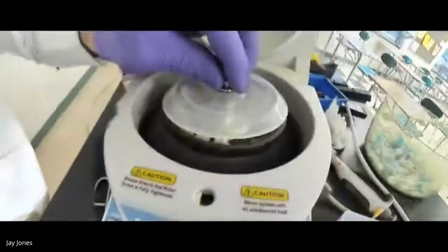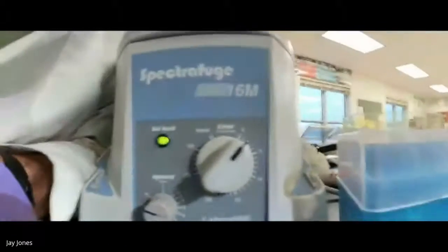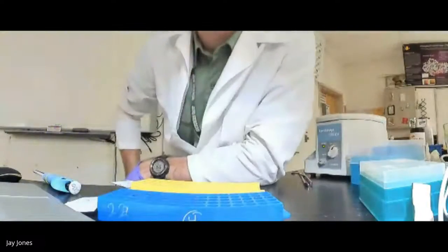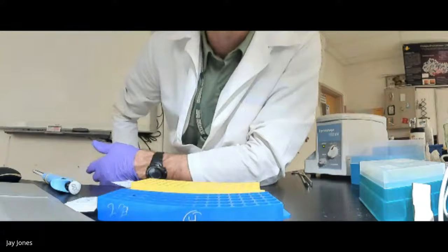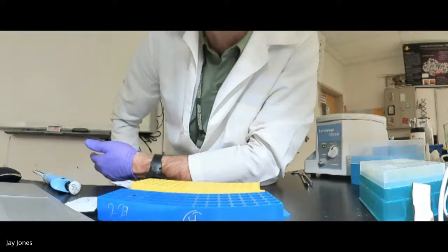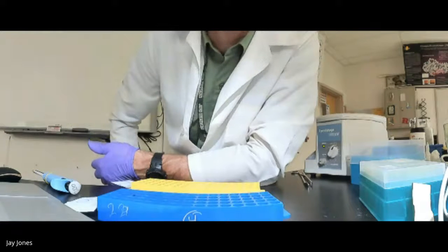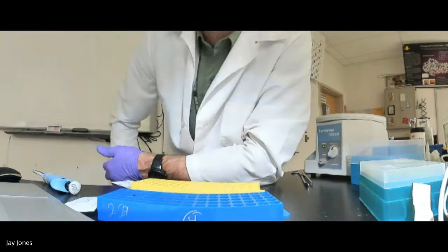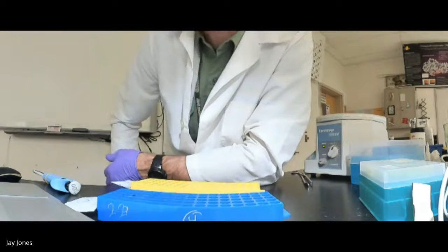Okay, let's do it. We're gonna flow the elution buffer, which is mostly water, through, a minute and 10. The water is going to pull the DNA off the column because the water is more polar than the column. Ethanol wasn't, but the water is. The water wins the contest of polarity with the column and pulls off the plasmid DNA, and the plasmid DNA should elute with the water.